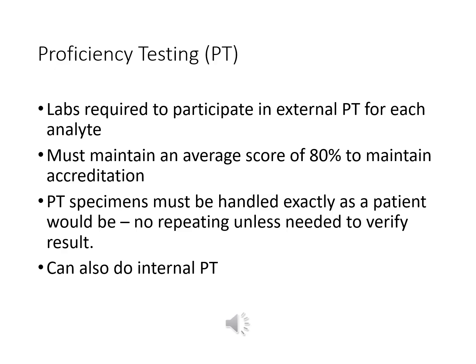Some facilities can also do internal proficiency testing, and really the same person should not be doing the testing for proficiency testing. So a lot of times labs will create a calendar of sorts that shows who's going to be doing it each time it comes in.